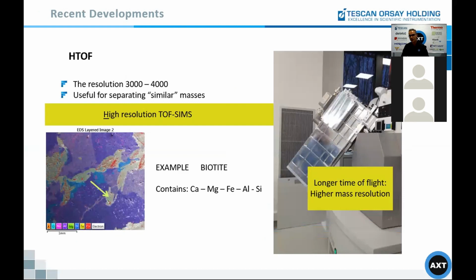And also, a new version of the detector came out maybe a year ago, which is called HR ToF. So it's got a bigger chamber for mass identification, which means better mass resolution. With the high resolution ToF, the mass resolution goes from 500 to almost 4,000, which is a great improvement. And it allows for more accurate isotope identification and gets rid of a lot of overlaps that we might have with the C version of the ToF-SIMS detector.